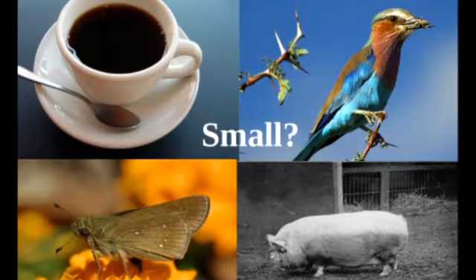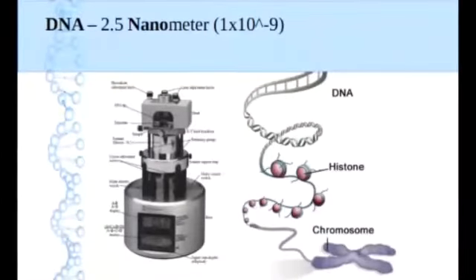Everybody has a different meaning for the word small, since it is such a relative term. Some people think of a bird to be small compared to a car, or a butterfly to be small compared to a bird. Something I consider to be very small would be DNA. I have been working in a research lab here at UCSD studying atomic force microscopy, and I just wanted to explain a little bit about what I do.